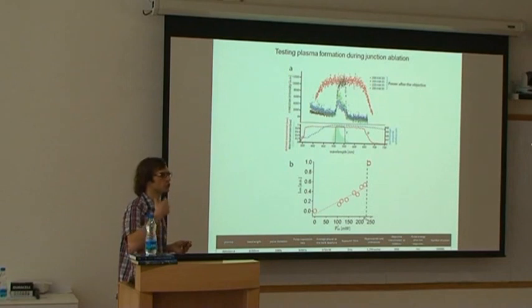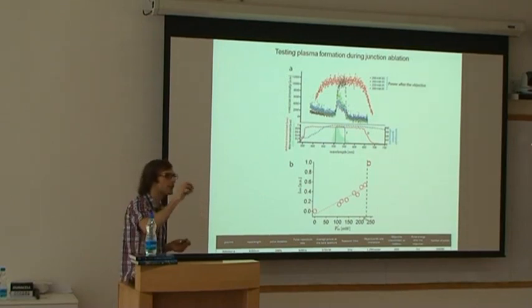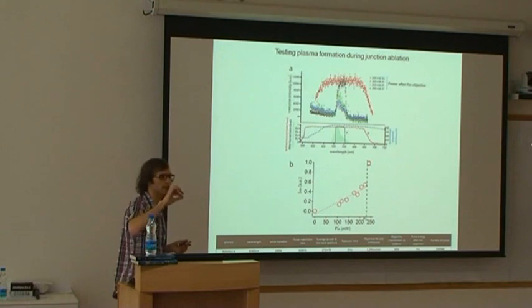Normally this plasma is producing sounds, as we heard before, but it also produces light, as we saw in the small movie. And this had a much broader spectrum. So by doing this laser ablation, I was really creating locally a plasma and dissecting the junctions.